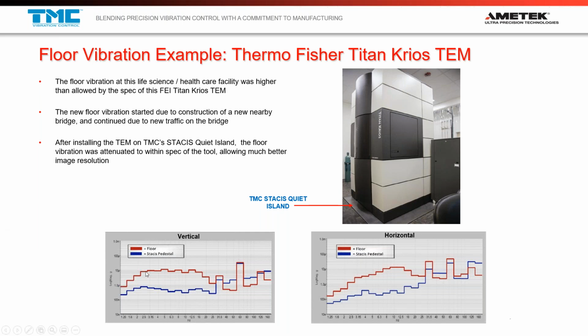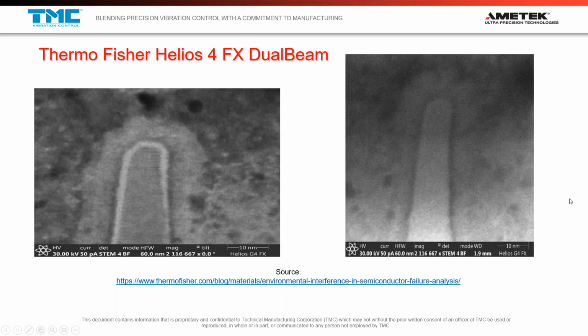And the performance between the measurements on the floor and the measurement on the platform top by an independent sensor is obvious. We see similar performance, a really good separation between the floor and what's measured on the platform top, and in the horizontal as well.